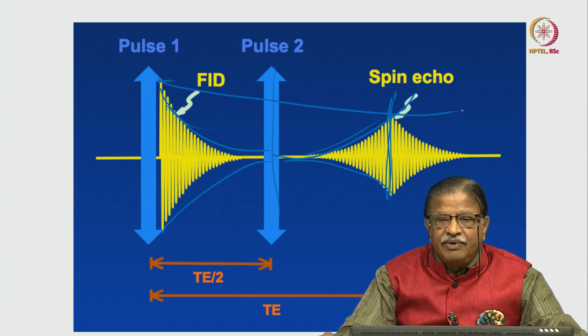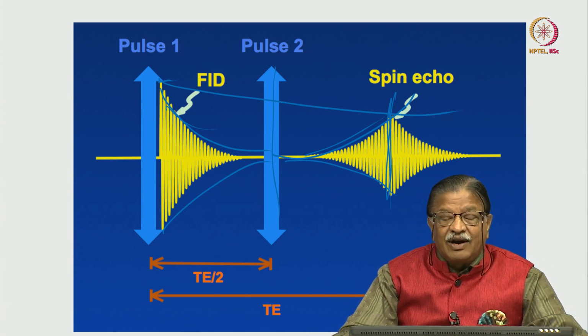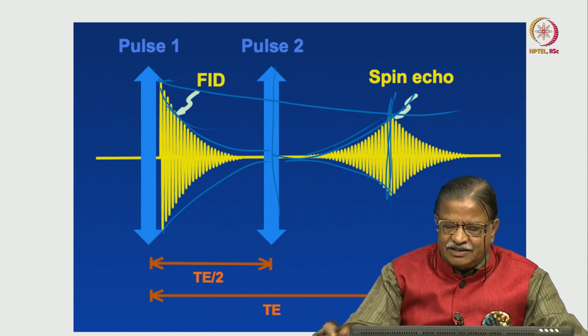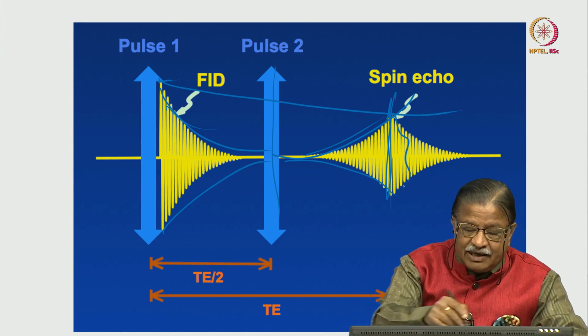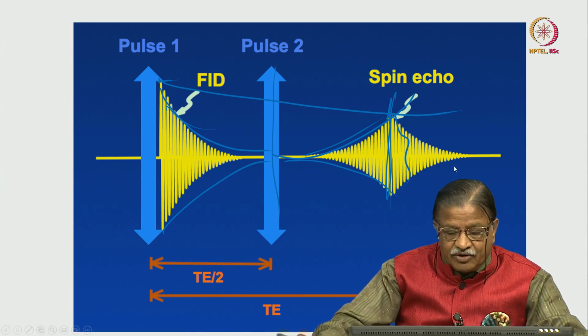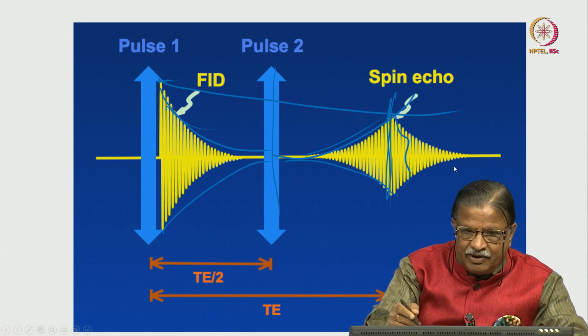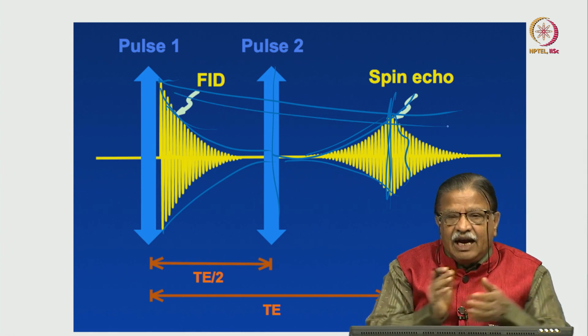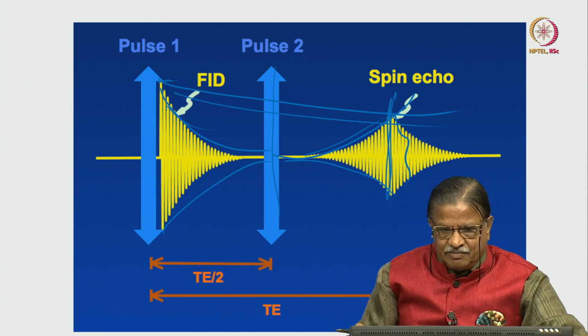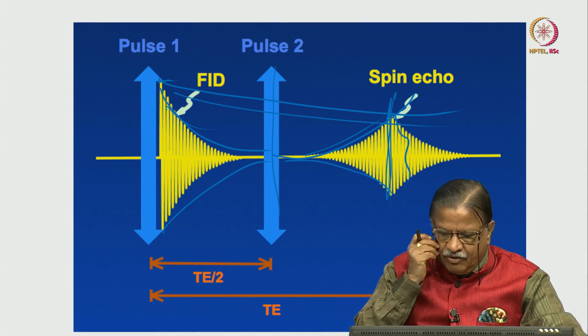Because between this time there is what is called relaxation. Because of the relaxation, the intensity of the echo has come down, but it still forms an echo. It gets rephased. This is one of the T2 experiments. We measure this decay and measure the dephasing time, that is T2, the relaxation time in the transverse plane. Okay, this is how spin echo works.